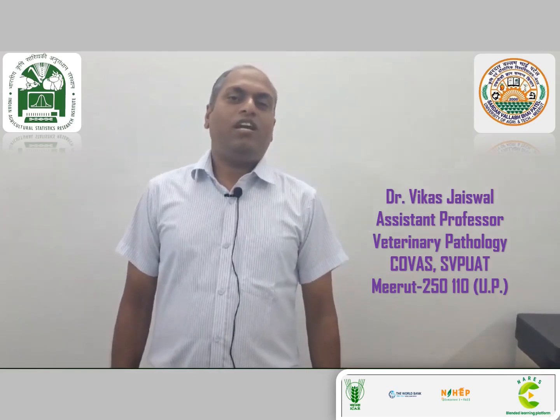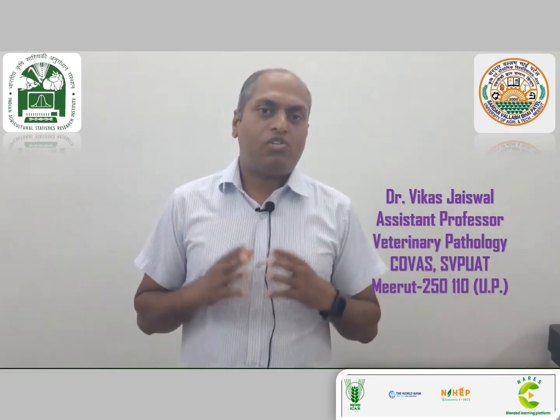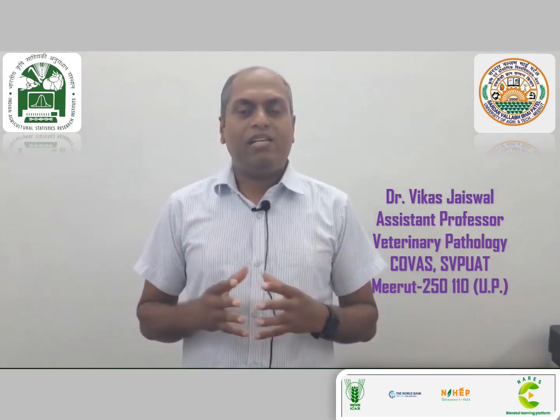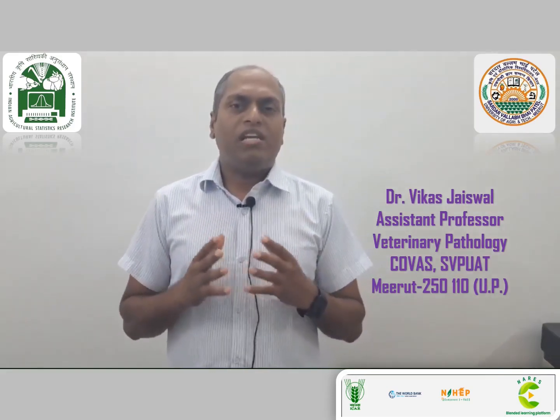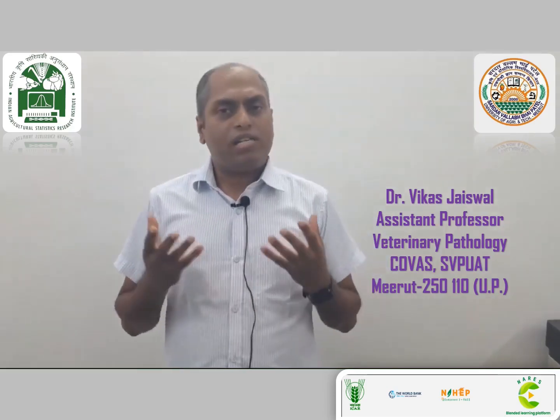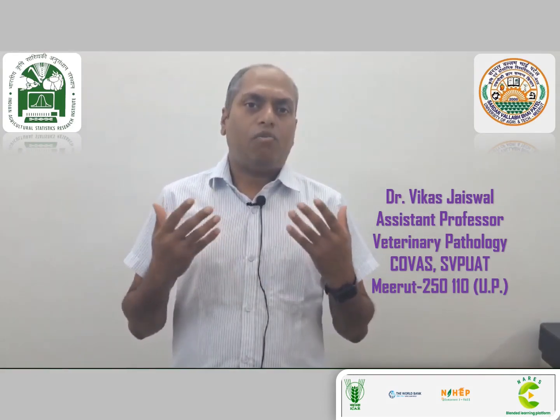Friends, today we are going to discuss a very important topic: how to set up a histopathology diagnostic lab. In this topic, we'll discuss what the guidelines are, what the requirements are, what the different sections are, and what the need and application of this technique is. Also, who the clients are, and what the strategy of sales and marketing of this technique is, to develop it as an entrepreneurial opportunity.